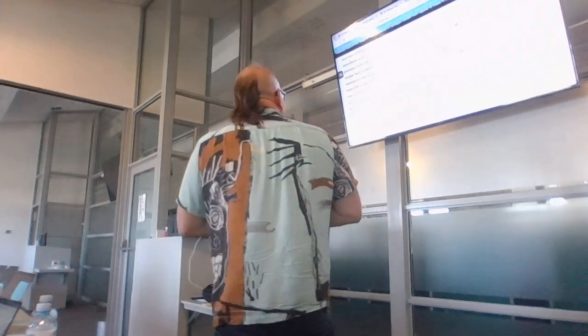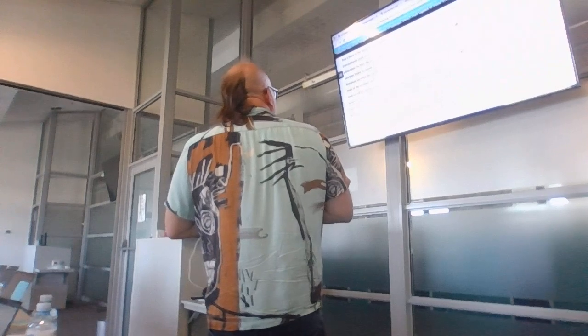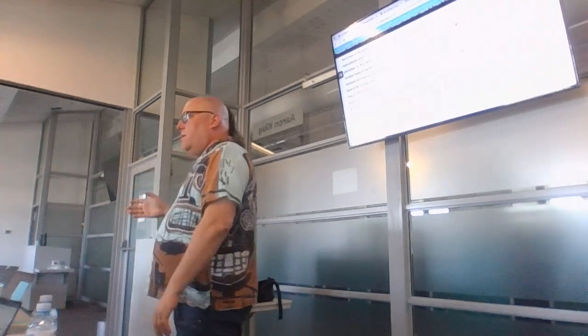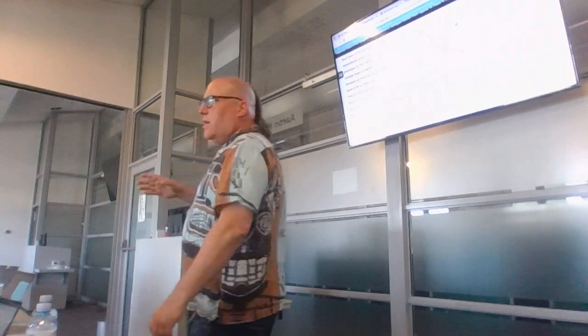The difference seemed to be related to a change in the wbeT gene. Okay, so this led me down a real rabbit hole.